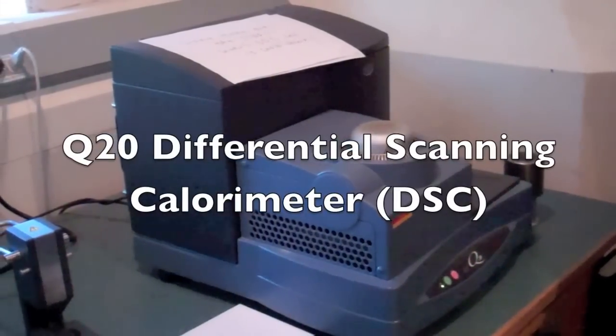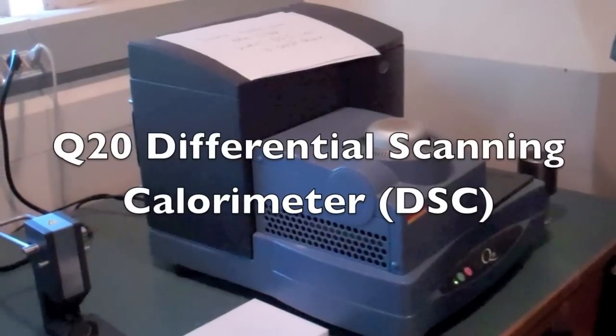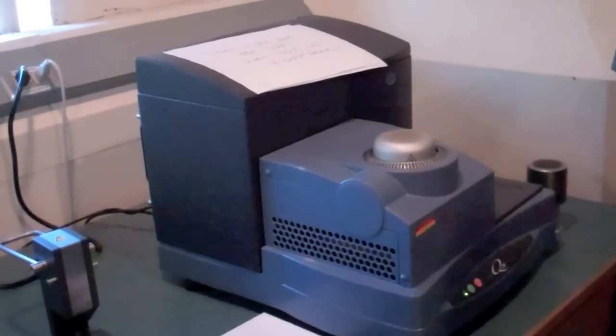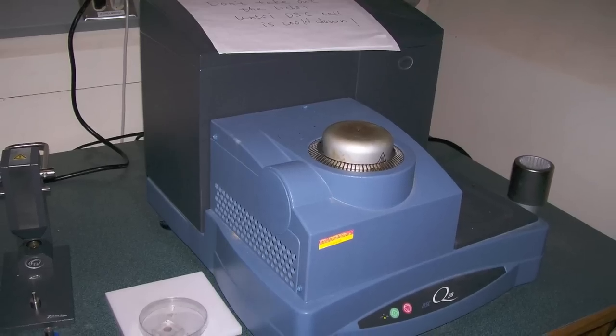The Q20 differential scanning calorimeter is used to measure the heat flow of a sample with respect to temperature. It helps to characterize the thermal behavior and transitions of a sample.